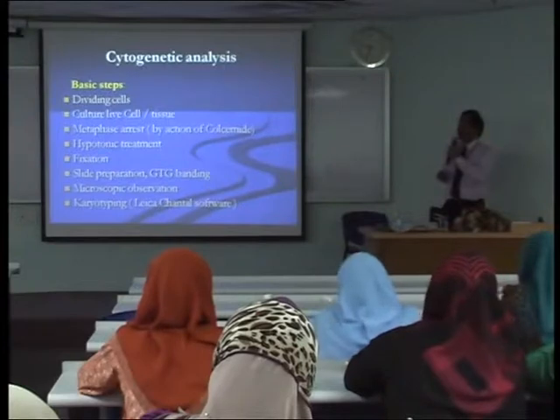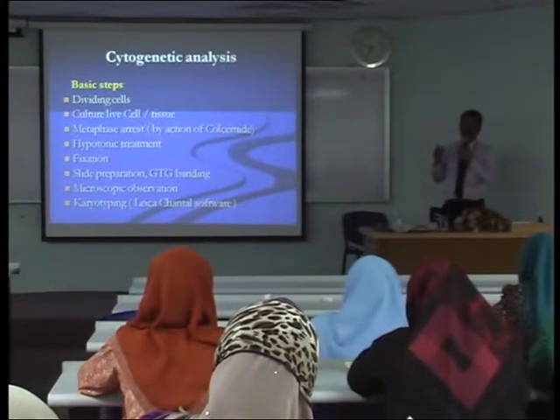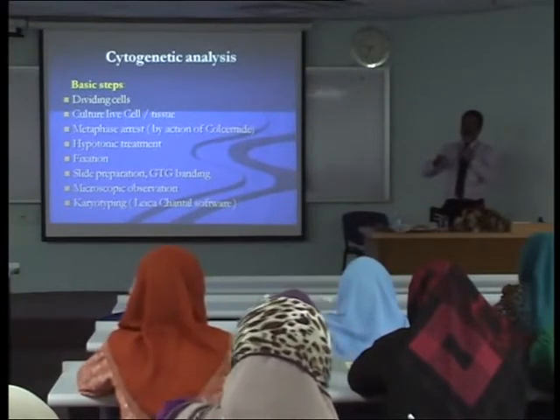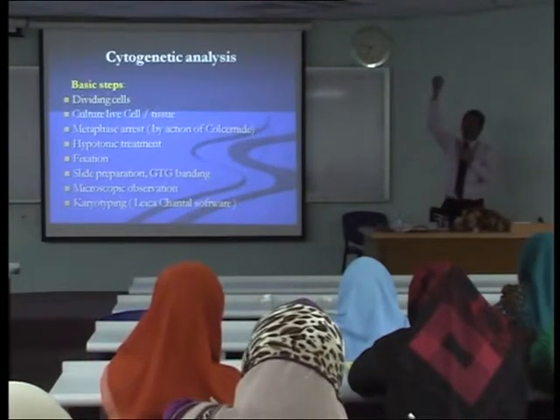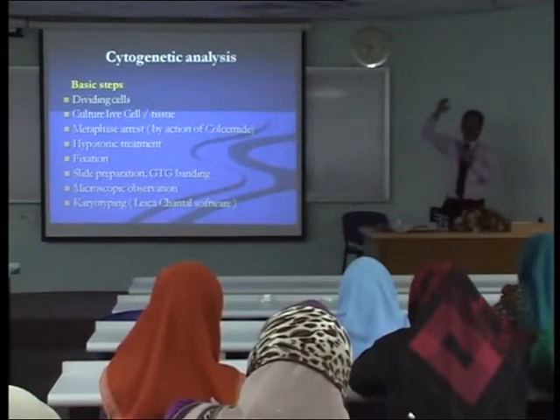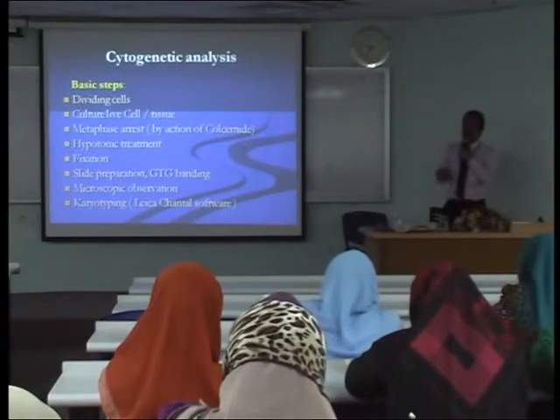That is also very, very critical. The technologist who is doing this should have very good skill, because we have to hold the slide in one hand and then take the cell suspension in another hand and drop from a distance. Because of this fall from this height, the cell wall will break and the chromosomes will adhere to the slide. That is very, very critical.